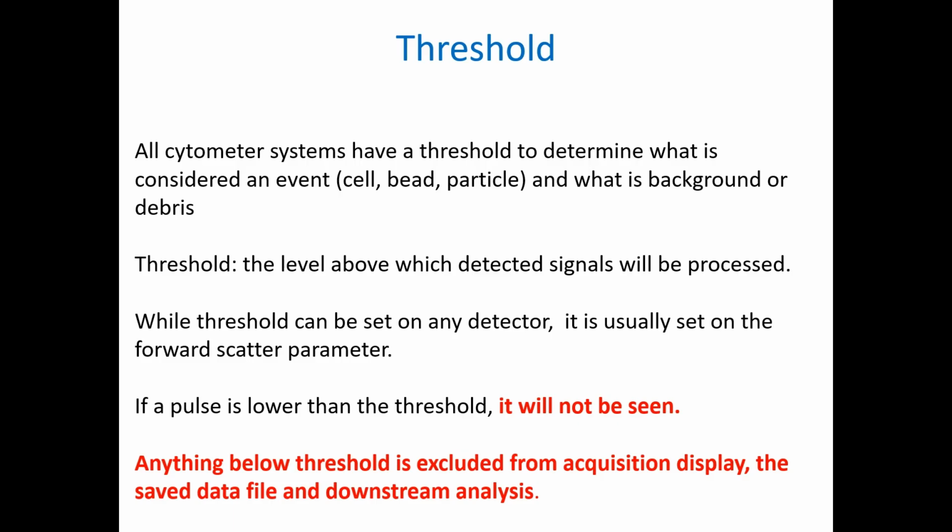So if a pulse is lower than threshold, it will not be seen or processed. Anything below threshold is excluded from acquisition display, from the saved data file, and any downstream analysis.